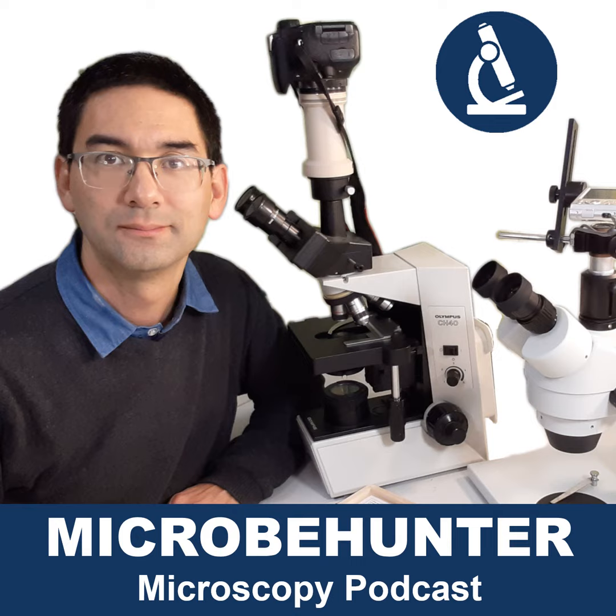In recent years, what microscope manufacturers have come up with are the so-called infinity optics, and they are totally not compatible at all. First of all, the threading might not fit because it's manufacturer specific, and also the way that the optics work doesn't match. I've heard that some people have managed somehow to attach an infinity objective to a classic 160mm microscope, and they were able to get it to work with a lower image quality, but that is not something that you would normally do. I would say that is rather experimental.